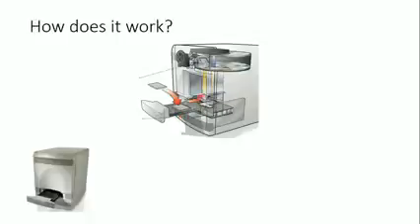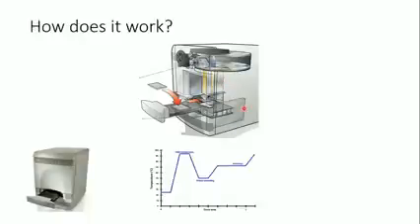Here is the thermocycler, like the normal PCR. What you're seeing here is the normal thermocycler, and what you're seeing here is the extra, which is the spectrofluorometer. The thermocycler undergoes the normal 3 steps thermocycle, and then the spectrofluorometer measures.